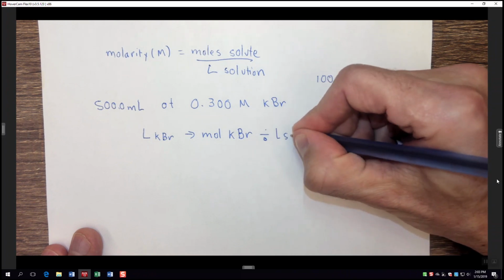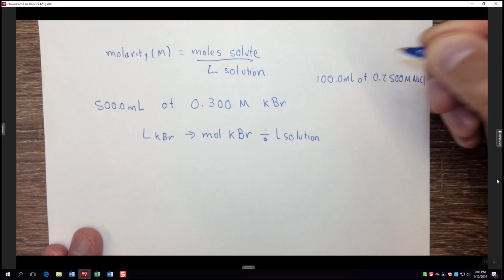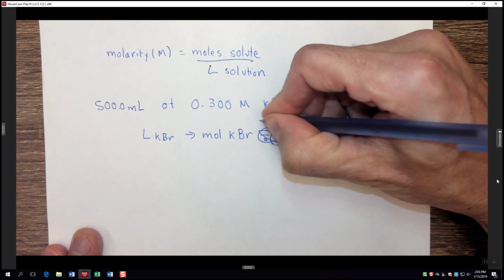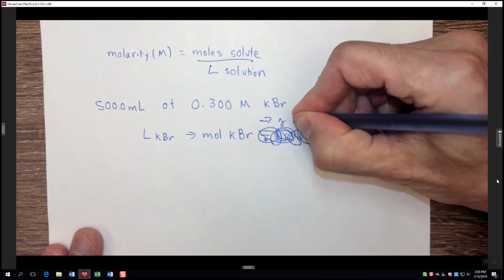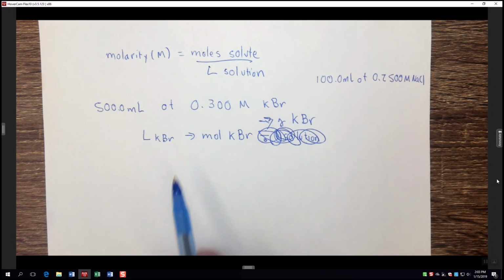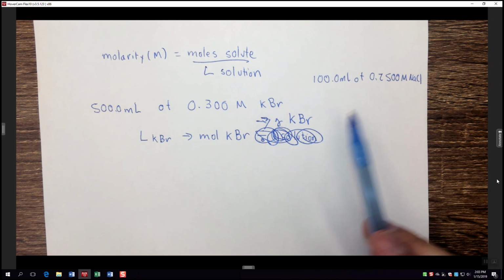So now that we've talked a little bit about generally what a calibration curve is and what's going on with these ionic compounds when we dissolve them in solution, now we have to look into the specifics. Specifically in this experiment, you actually have to make sodium chloride solutions in order to measure their conductivity. And the first thing we ask you to do is to make 100 milliliters of a 0.25 molar NaCl solution starting from solid sodium chloride.